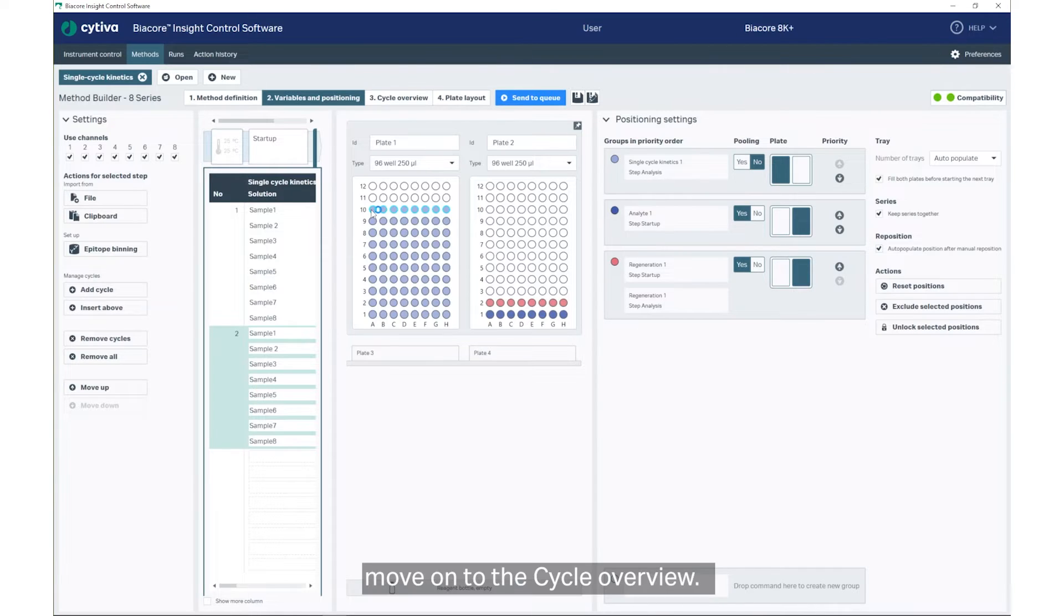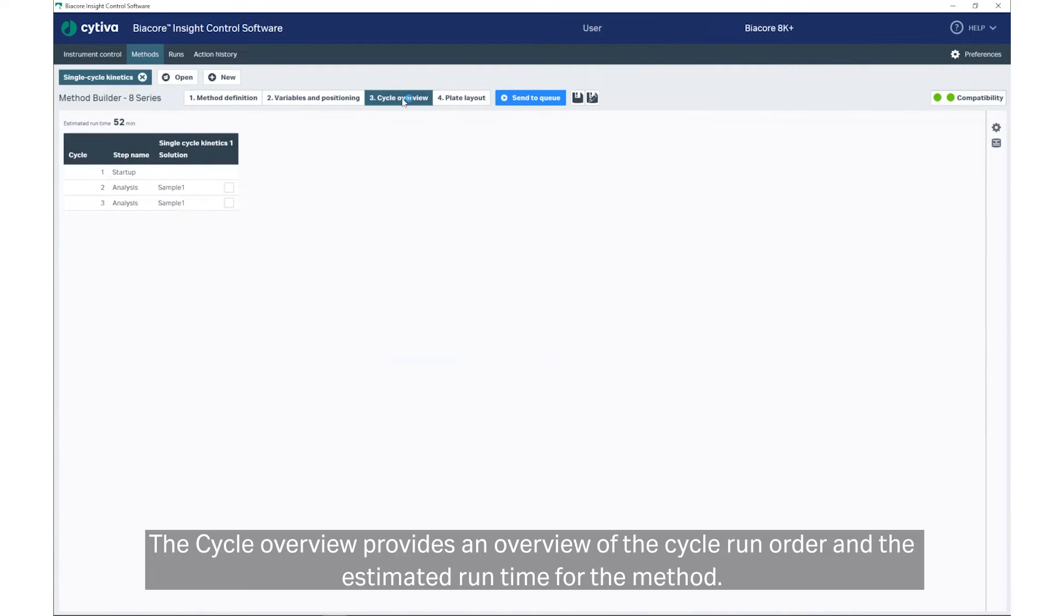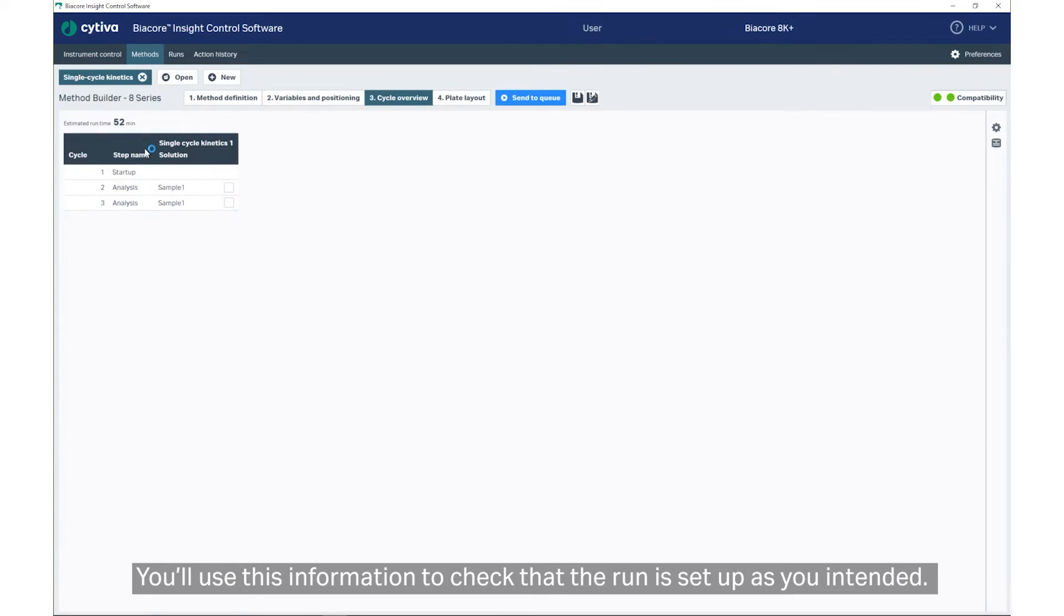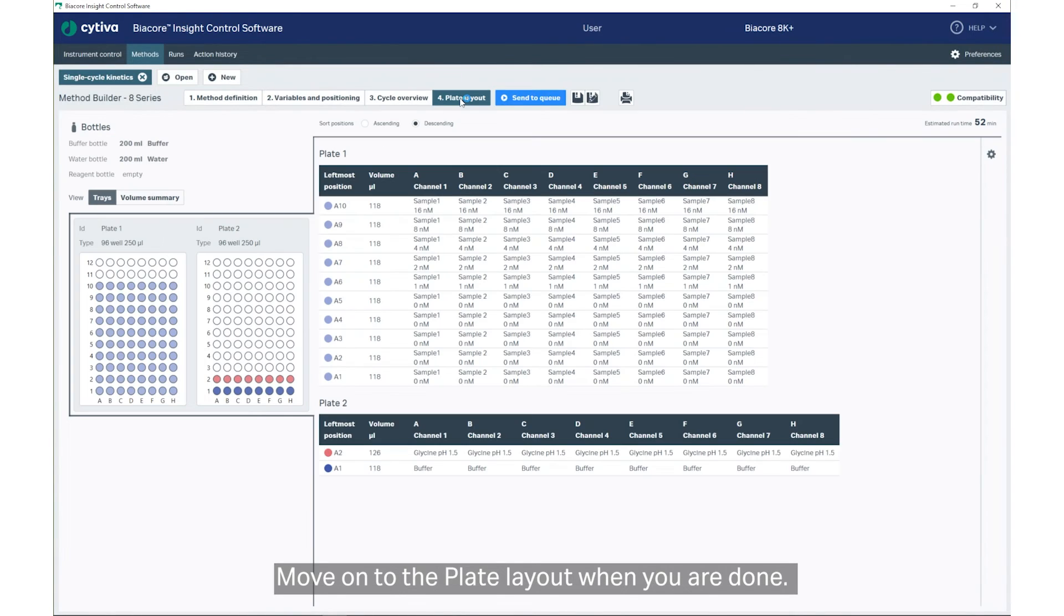When you have updated the positioning, move on to the Cycle Overview. The Cycle Overview provides an overview of the cycle run order and the estimated run time for the method. You'll use this information to check that the run is set up as you intended. Move on to the Plate Layout when you're done.